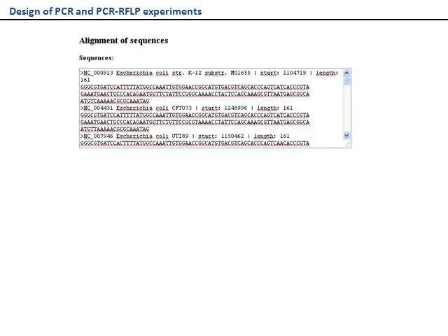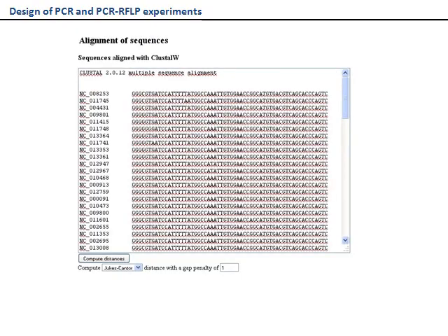Before the alignment results, all the fragments are shown as FASTA. And the alignment result from Clustal W is provided. A form located at the bottom allows the user to compare and group the sequences. 2 methods are available to compute distances: an uncorrected one, and the Jukes-Cantor. A gap penalty value may be set up. To compute the distances, the button must be clicked.